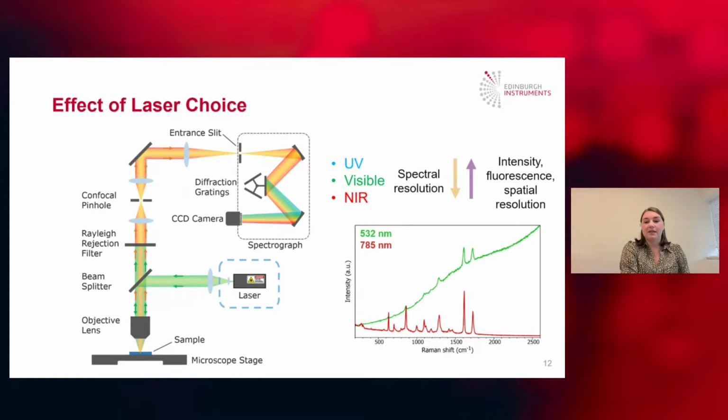Finally, the spectral and spatial resolution will also affect the wavelength that you select, with higher spatial resolution as you move to UV and higher spectral resolution as you move to NIR.